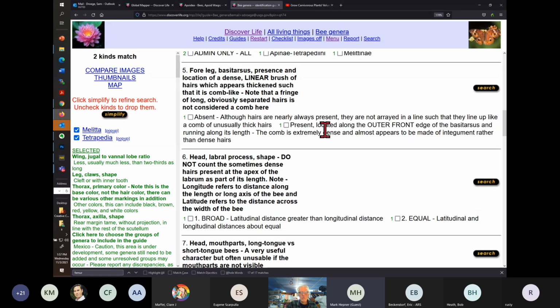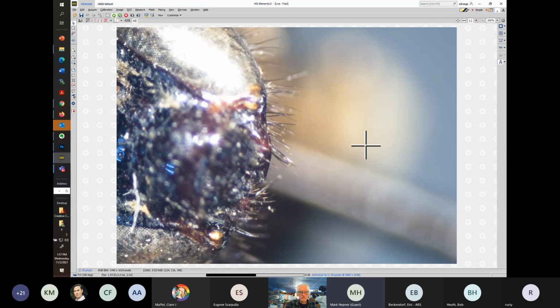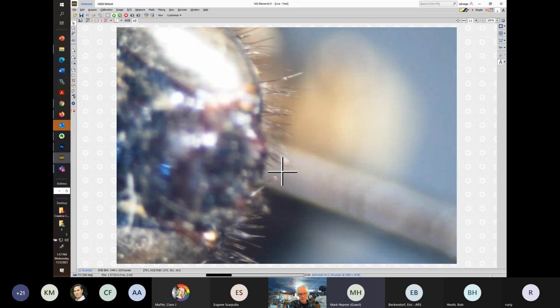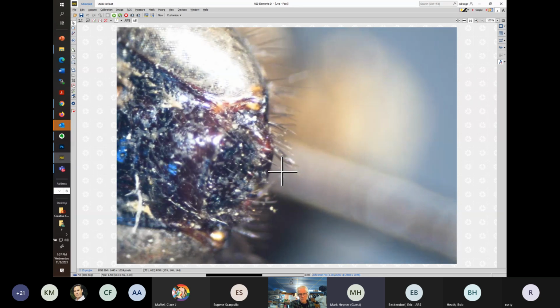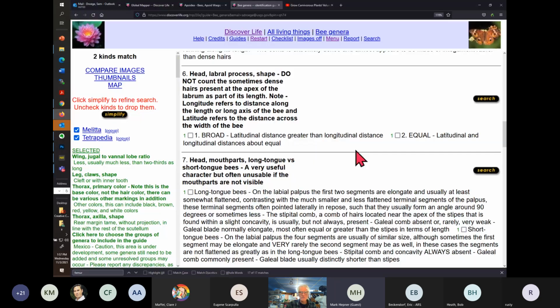We have a whole list of possibilities here. I think we have this in view. I don't know if the labrum is going to be visible here because the mandible is closed. Or lack of time, what happens? So we have them separating unless one is scored for both, and that might be the case. Yeah, so one of these two is scored for both and the other is not scored at all, so they stay and remain.